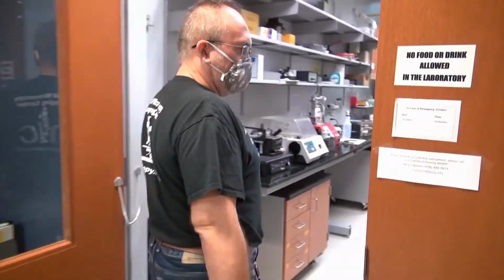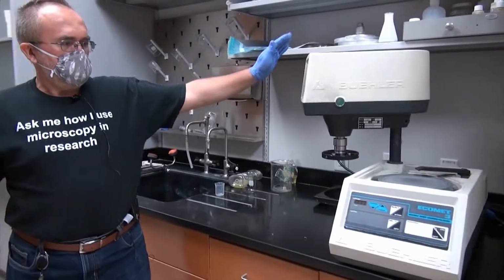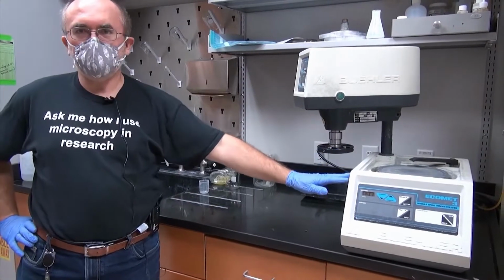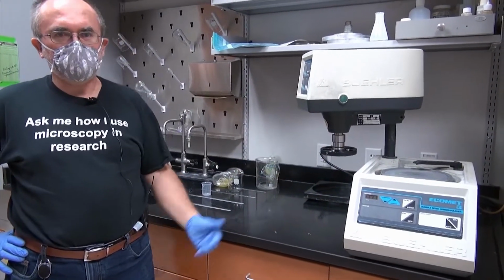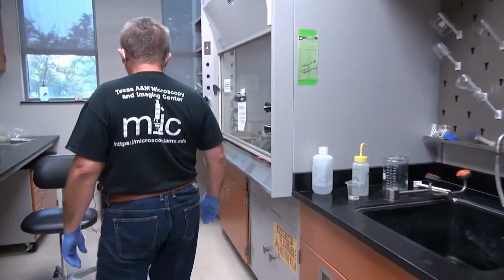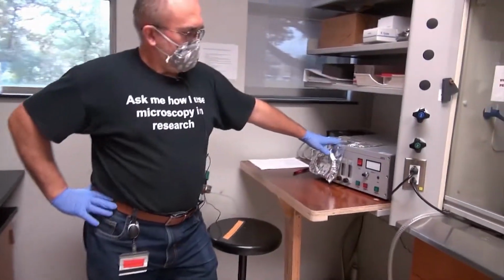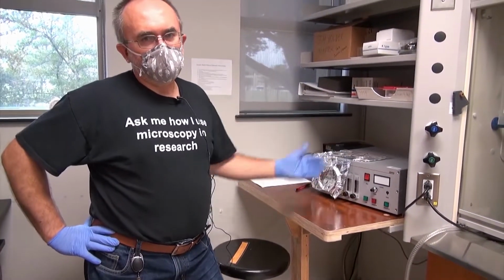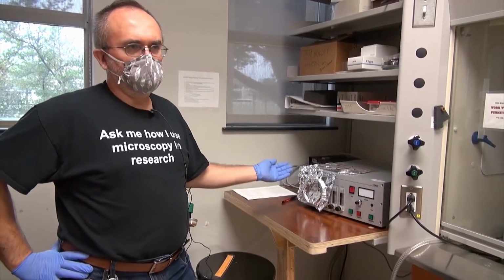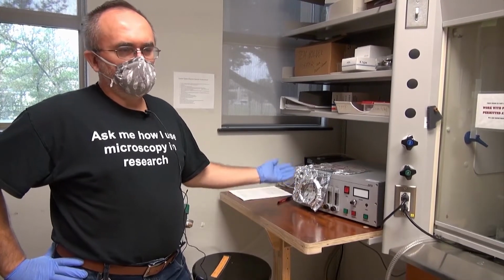In this next room, we have some more sample preparation tools. This is a polisher, and typically these would be used for polishing samples for scanning electron microscopy. We also have a plasma cleaner for cleaning samples, for instance, before some samples are put in the SEM or TEM, the impurities or contamination can be cleaned off.